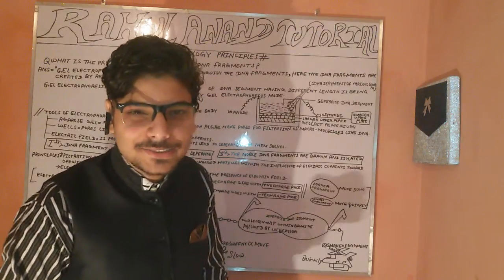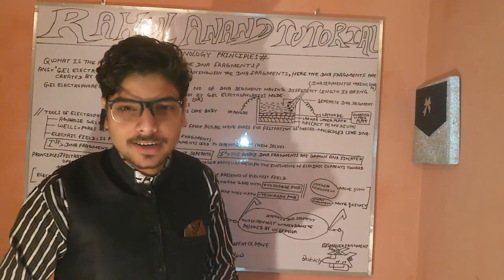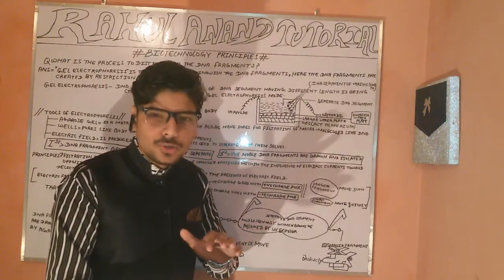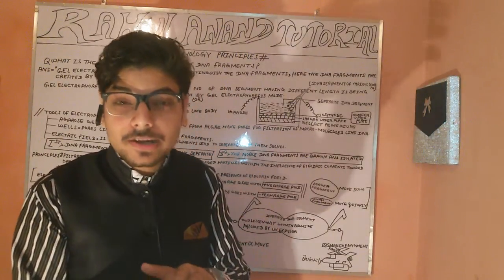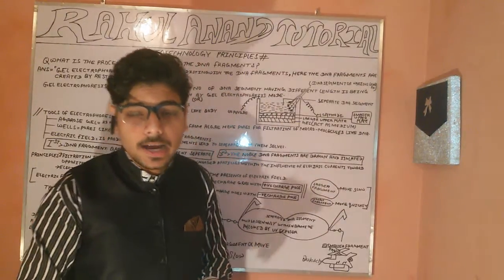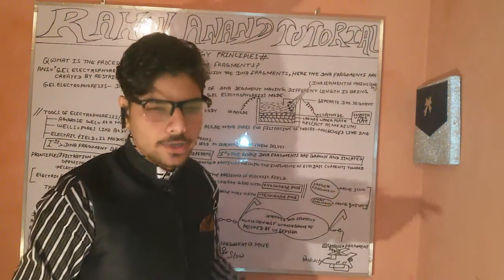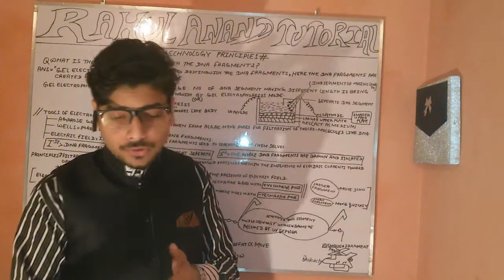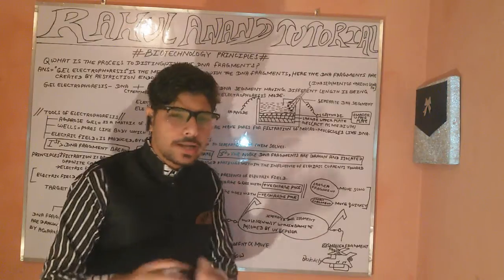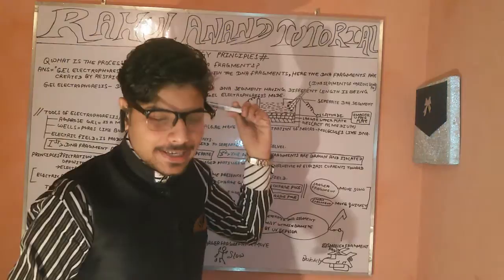Now, second is the wells. What does it actually mean by the wells? Wells have a pore-like or cavity-like structure. These play an important role in giving storage accommodation for the larger molecules of DNA, the deoxyribonucleic acid. So these wells play an important role to attach those DNA molecules, which are quite macro in nature, with reference to our algal resin as well as the agarose gel resin.